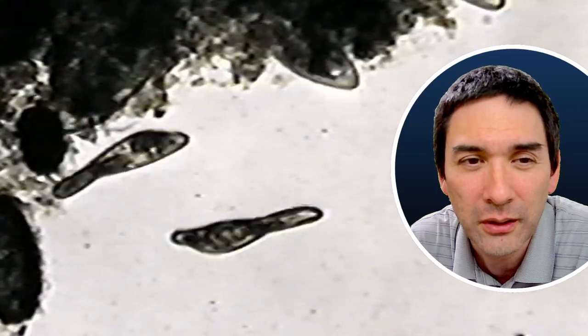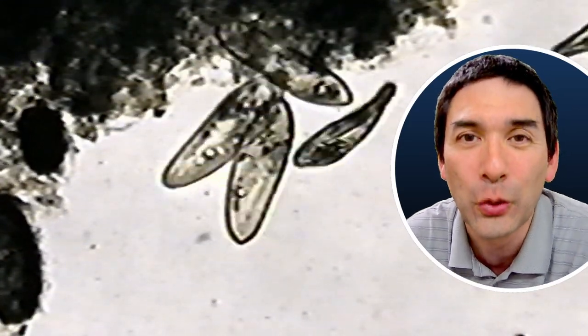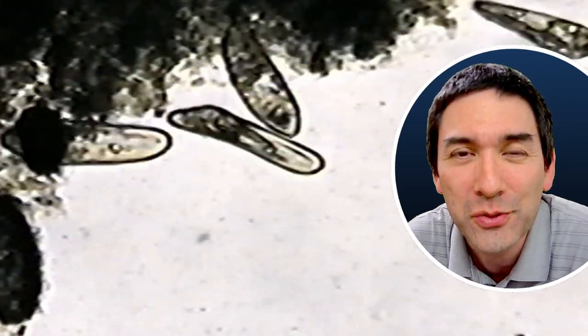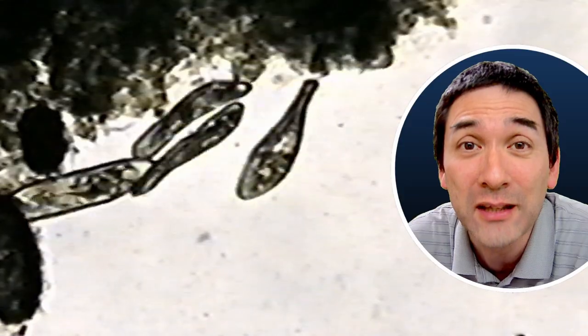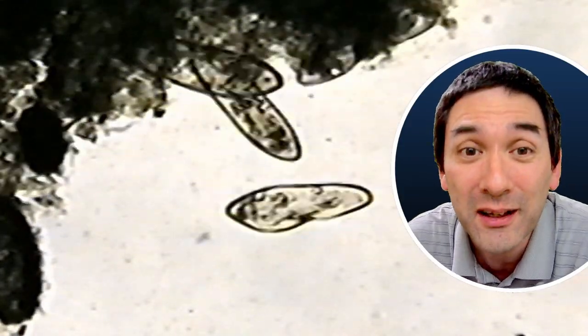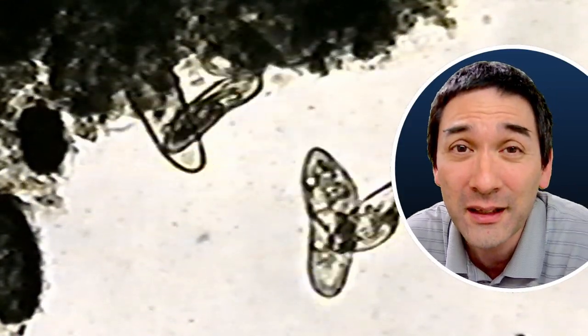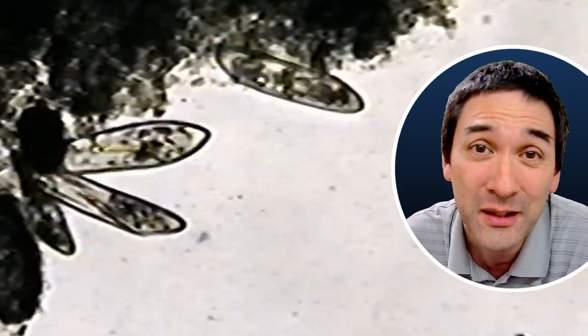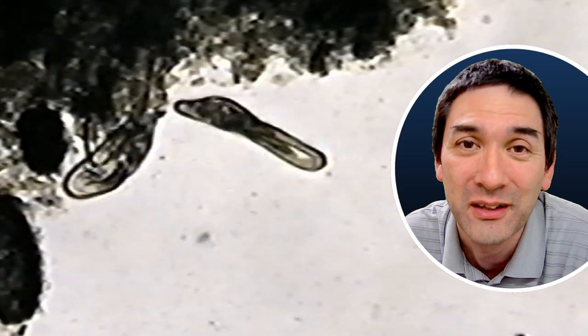And that's the next one here. These are paramecia. And you might now wonder about the somewhat lower image and video quality. And the reason is I'm very happy about this video clip here, because this was actually one of the first videos that I made 23 years ago, back in the year 2000. And I recorded this on a videotape, on an analog magnetic videotape. Obviously, at that time, video recording was not digital yet, or at least was very expensive to have digital. So at that time, I still used the videotape.